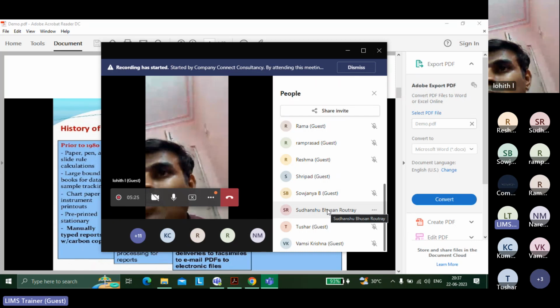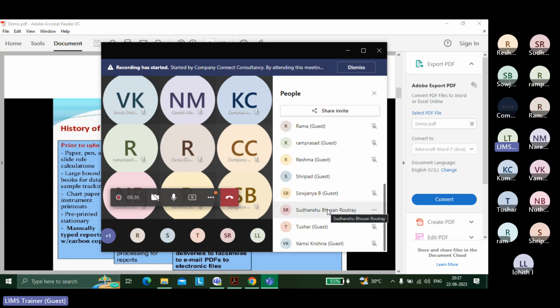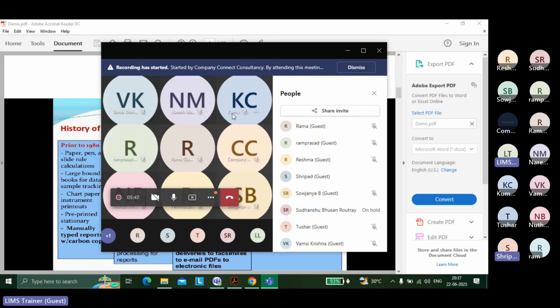That's the toughest thing, because many will say, okay, we can work on inventories, we can do audit trail, we can do this, we can do that. Yes, I know we can do a lot of things. But my point is, what is LIMS? When we start a course on something, we should first be able to define it, right? Is it clear now? Happy with the definition? Now someone asked me something, you can go ahead.